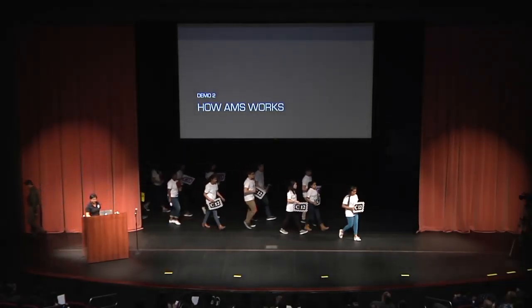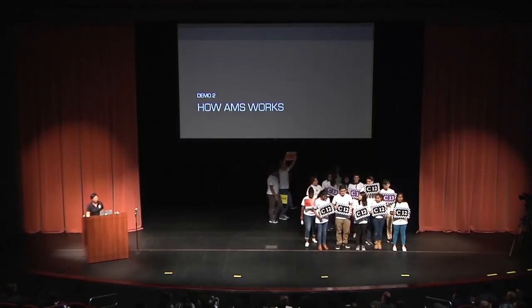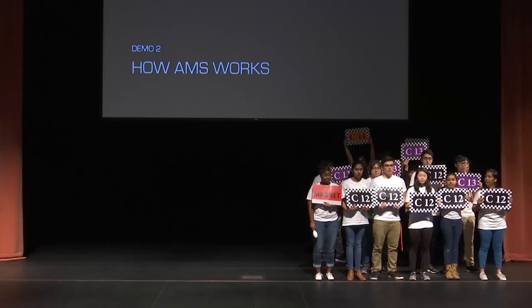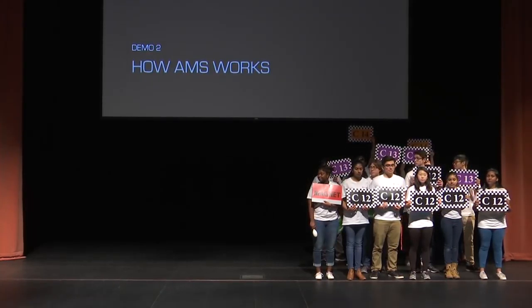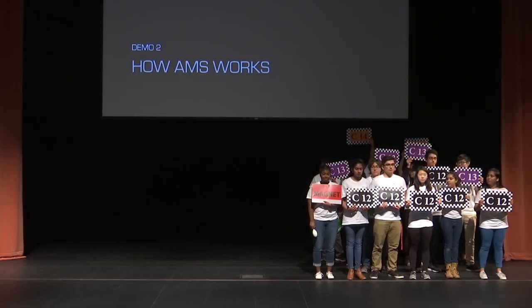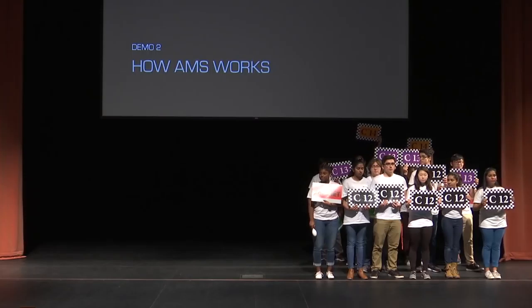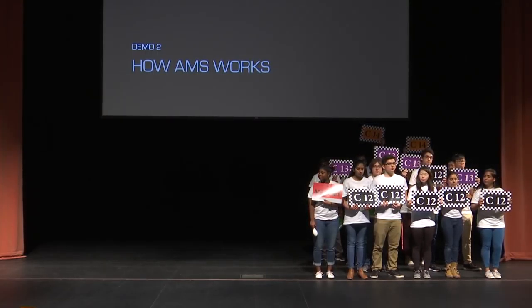All right, Doherty Valley Biotechnology is back. And we are here to model how an AMS, or an accelerator mass spectrometer, works. So remember, AMS has the ability to separate atoms into different cups. And I want you to imagine an AMS as a track for atoms, in this case, carbon atoms. Some atoms are able to move through the AMS with no problems, while others struggle and can't make the turns on the racetrack. So let's set up this marvelous machine.